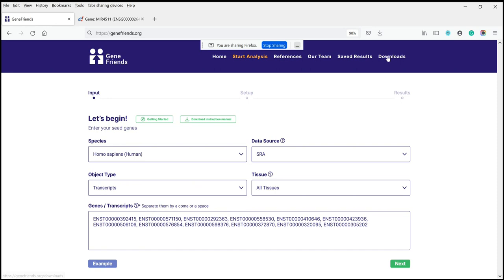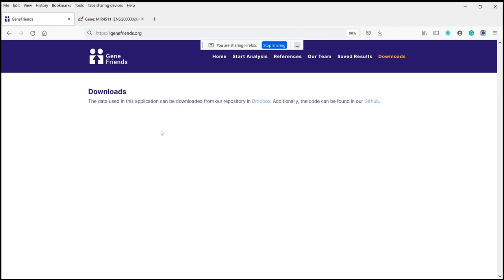Lastly, you can also download the data — all the data underlying the co-expression networks for all the species and all the tissues. It's quite a lot of data and at the moment it's in Dropbox, but you can download all of it and do your own analysis. One analysis not provided on GeneFriends is species comparisons — that's not implemented in the platform, but you can download co-expression networks for, say, mice and humans and perform comparisons yourself. Additionally, all the code for GeneFriends is available on GitHub.